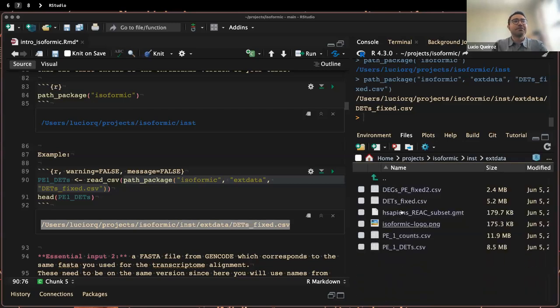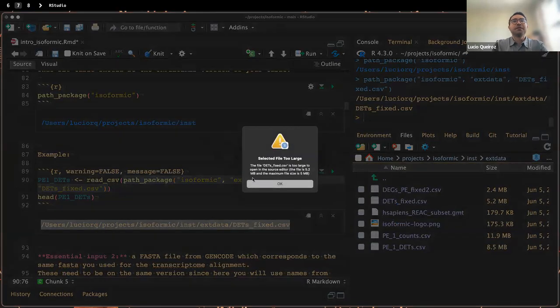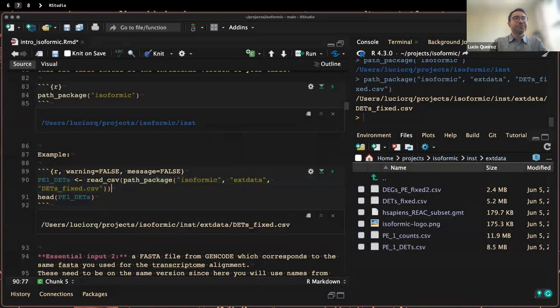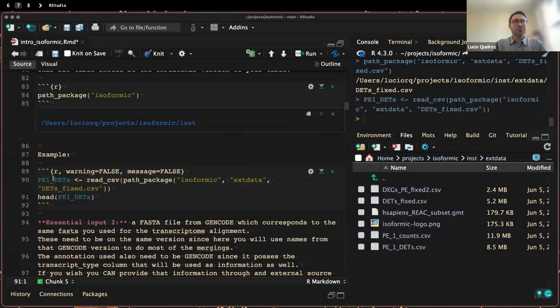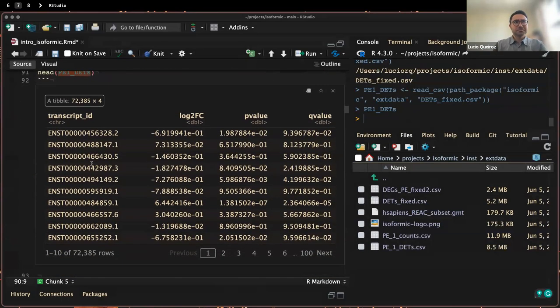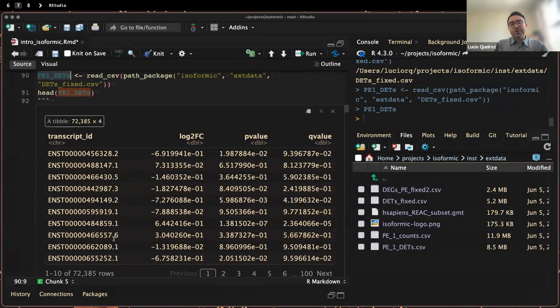Basically, like I said, we have some files here in the directory that contain the data for this CSV file. It is just comma separated values, like a table of the expression data. And with the read CSV function, we can load that data frame. Like I said, here we are starting from the step after you do the differential expression analysis.